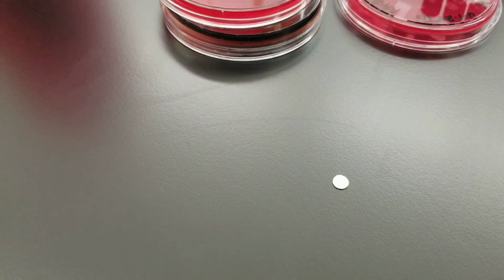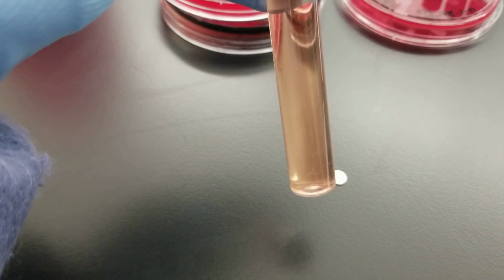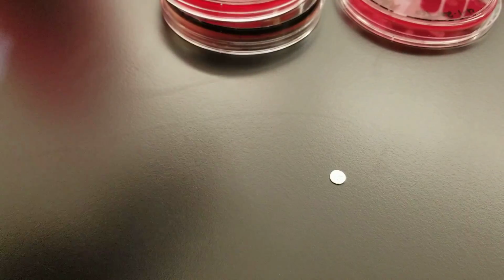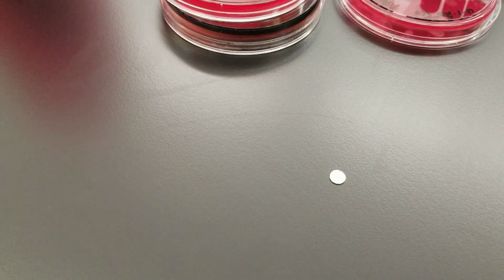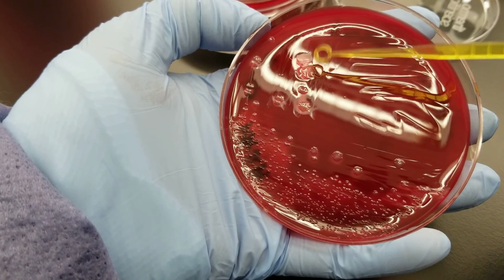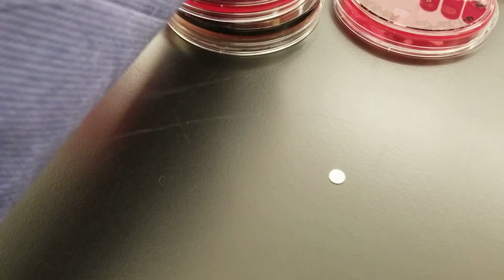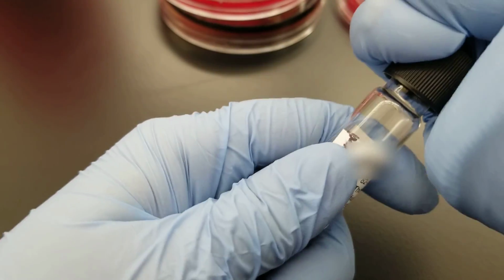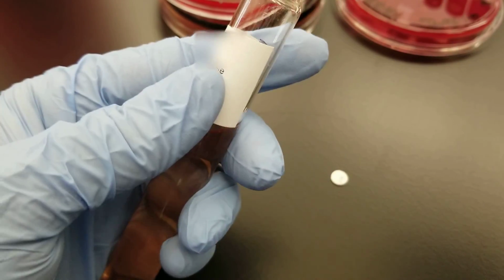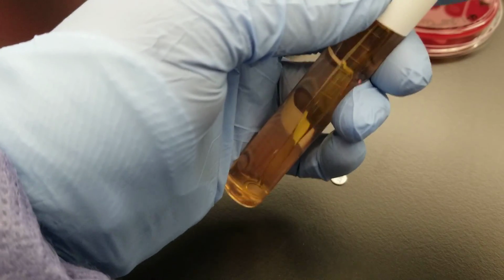And then I'm also going to do the thio because I forgot to do it since we were talking. Okay, so I'm going to inoculate the thio. All right, so with this, we're going to take it from the Brucella blood agar plate. That is where the growth was, and we don't have any indication of swarming. Okay, so I took it from there. Take your pinky, undo this, and then you're going to slide it in there without touching, and you're going to put it down at the bottom.